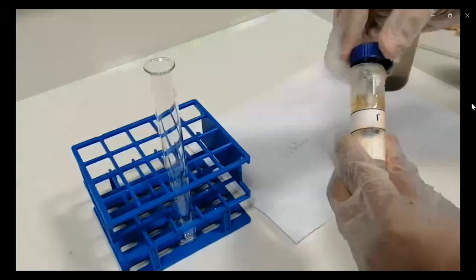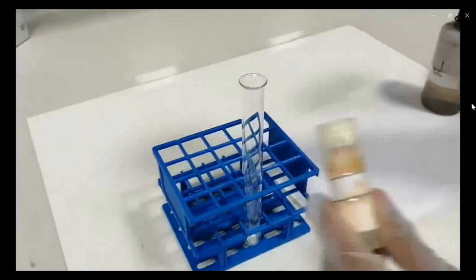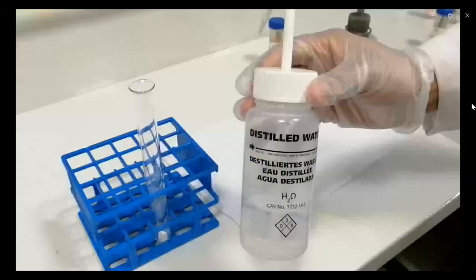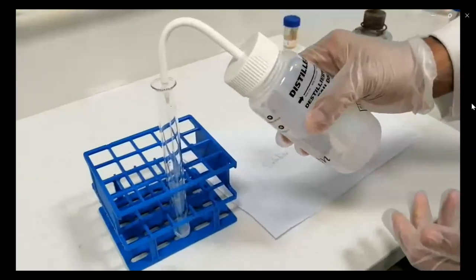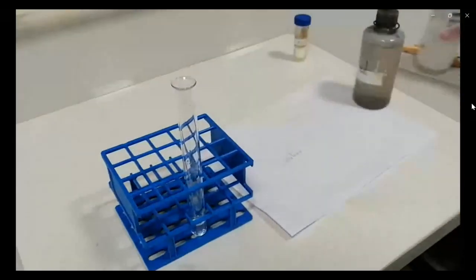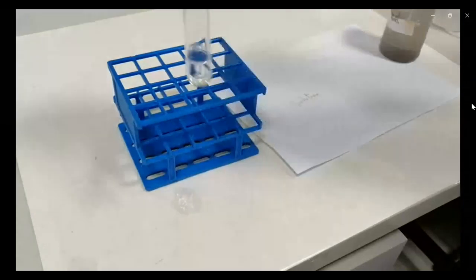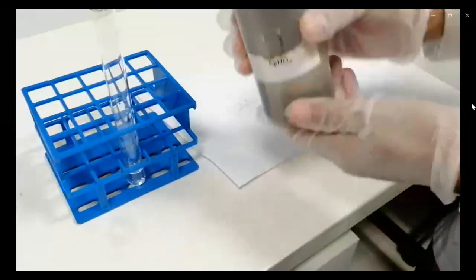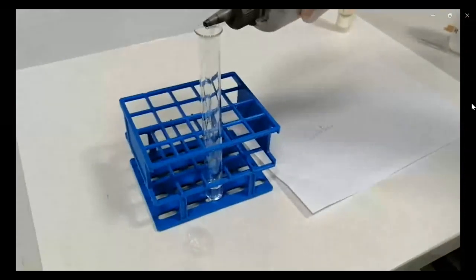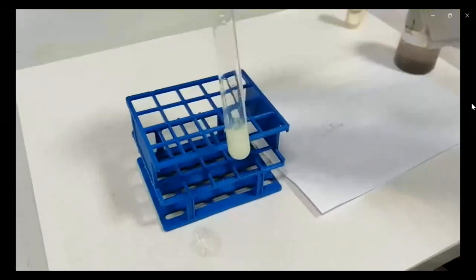In case of iodide, just a few crystals and add some milliliters of water in order to prepare a solution. Just mix them first, then add silver nitrate. You will see a yellowish or yellow precipitate. See, it's a yellow precipitate.